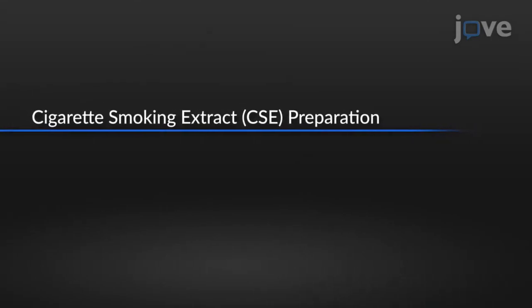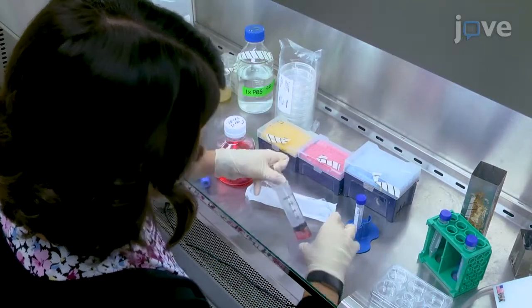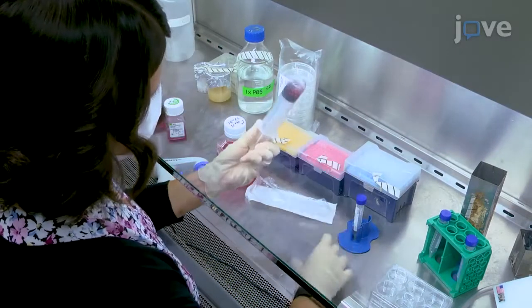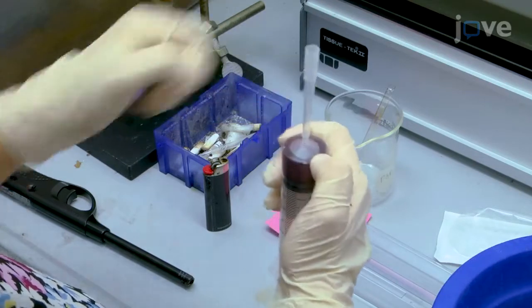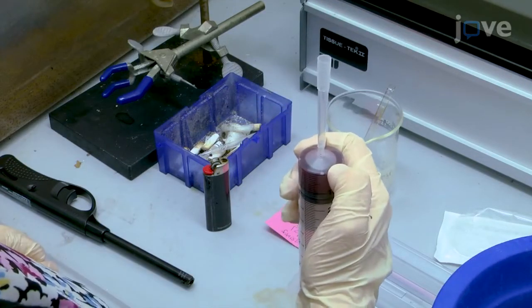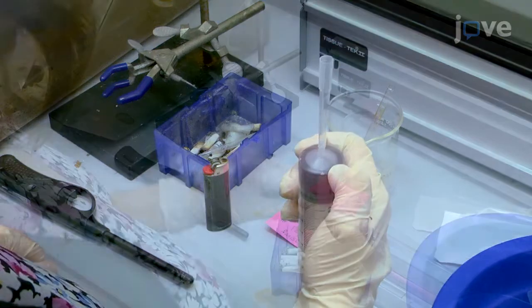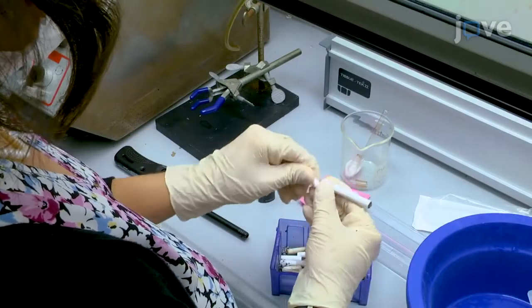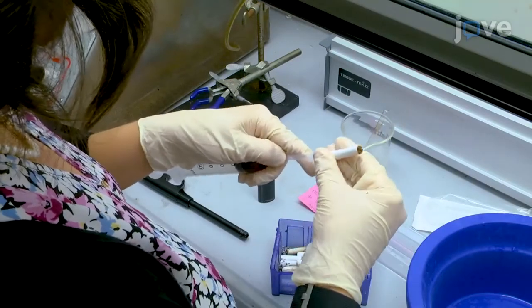Draw 10 mL of serum-free cell culture medium into a 60 mL syringe. Attach the narrow end of a trimmed 1 mL pipette tip to the nozzle of the syringe as an adapter to hold the cigarette. Remove the filter from the cigarette and attach the cigarette to the adapter.